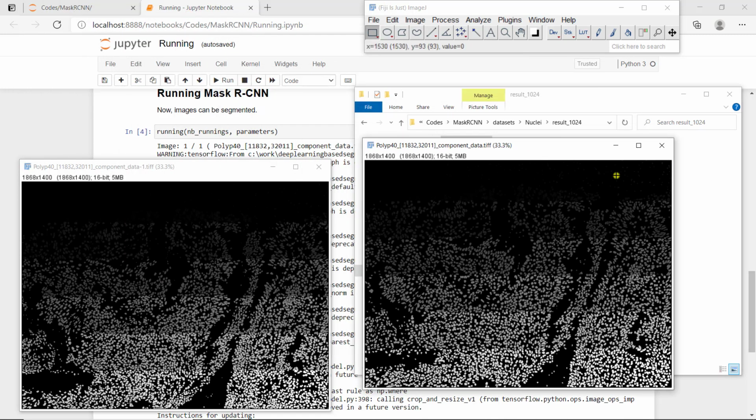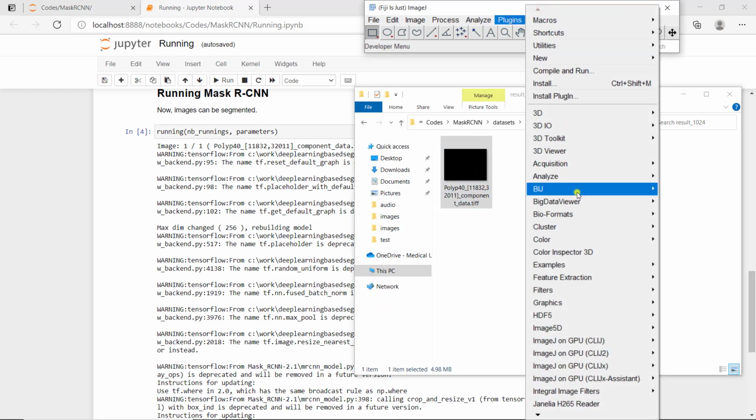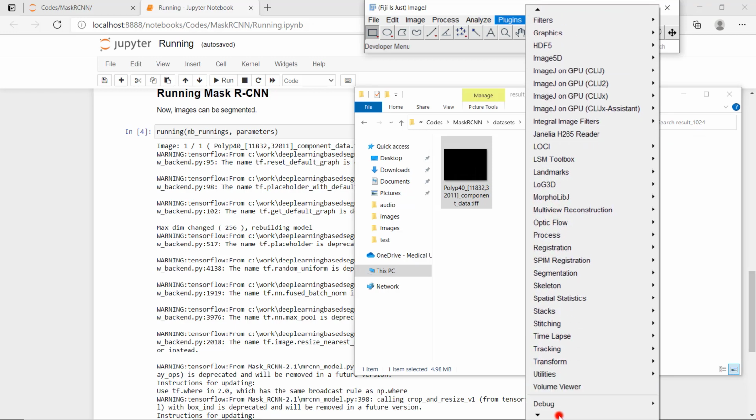So maybe we can open an annotator and look at the difference. By just looking quickly, we see that we might have a higher density here. So probably 512 is better. Maybe it would be good to also look at other scales. It works similarly to different scales, actually.